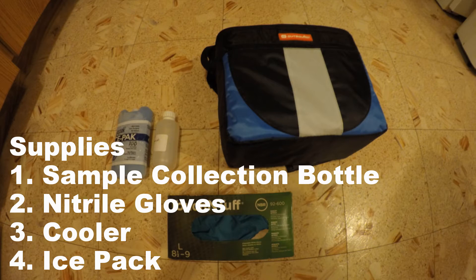The supplies needed are a sample collection bottle, nitrile gloves, a cooler, and an ice pack, and likely a boat or hip waders to get to your sample site. If you do not have nitrile gloves, please make sure to thoroughly wash your hands to eliminate the risk of contamination.